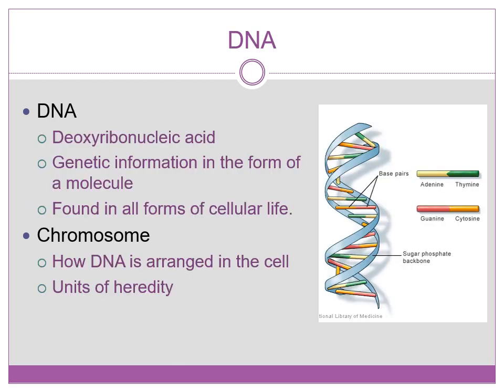DNA stands for deoxyribonucleic acid and is found in all forms of cellular life. Recall that viruses do not contain cells, and even though some may have DNA, not all have DNA and may have RNA instead.